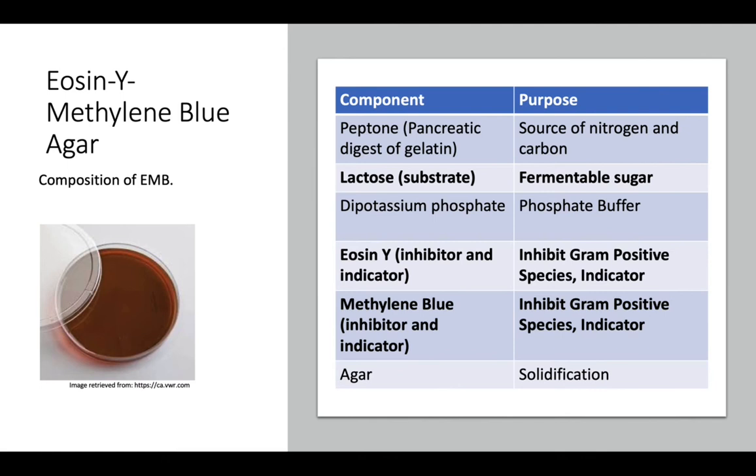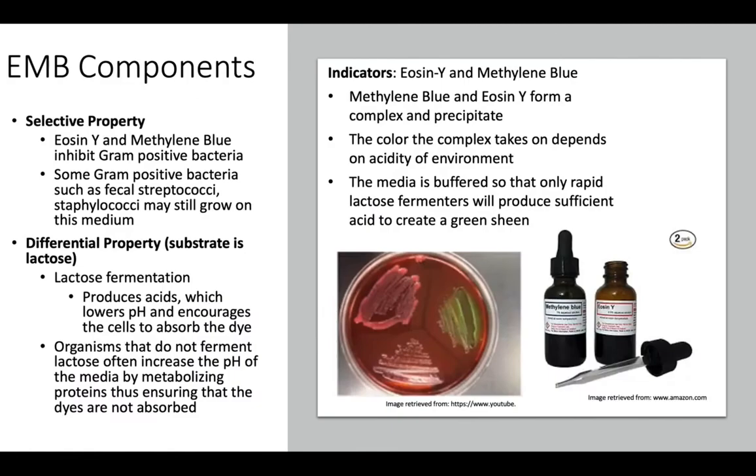So gelatin is just the cartilage from cattle, horses, pigs. It's what makes Jell-O solid. So if you thought you were vegan and you're eating Jell-O, that's not the case, unless it's vegan Jell-O. So gelatin is basically cartilage. That will vary based on the diet of the animal, the specific animal, etc. So we do not know exactly what components are there.